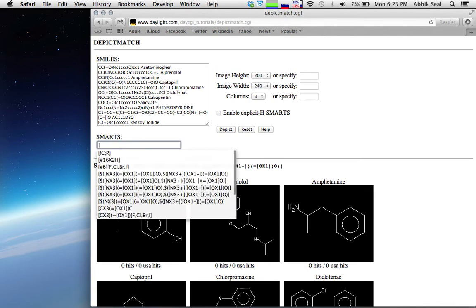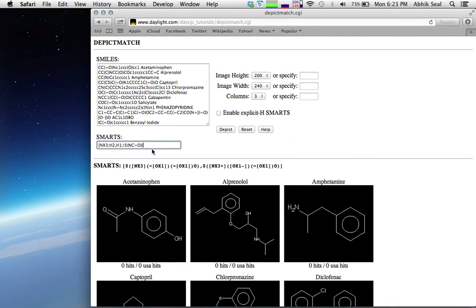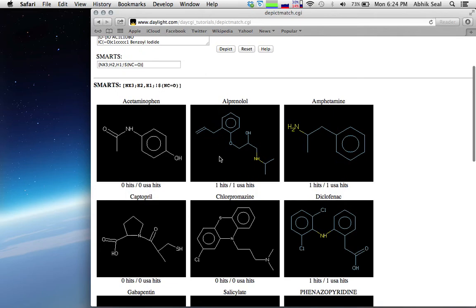Let's do primary amine and secondary amine but not amide. We write NX3 for aliphatic N with one or two further locations. This matches primary or secondary amine but not amide, since the amide group is represented by C(=O)NH. Adding a NOT sign excludes the amide, and you can see all primary and secondary amines got matched.